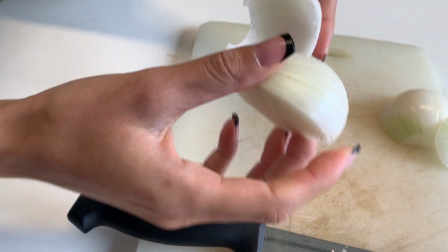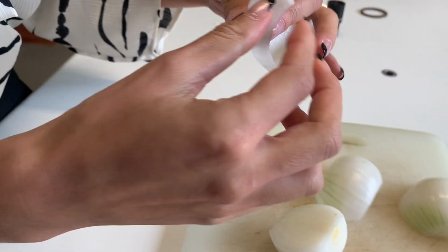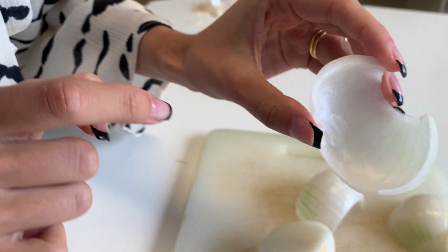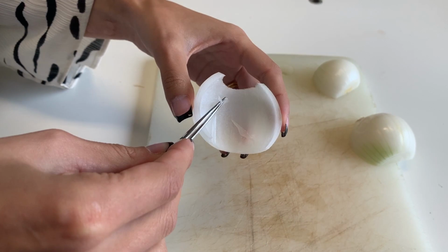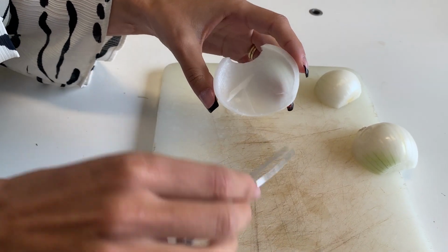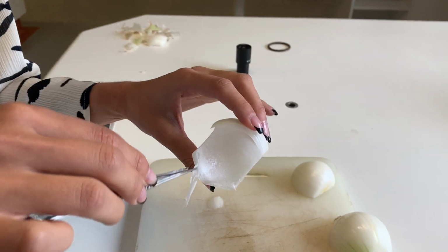So we're just going to peel off a segment here so we can start peeling off that thin membrane for us to view, and we can see there it's already peeling off nice. We've got a nice little thin piece here that we can peel off, and it will start folding in on itself, but that's all right. We'll undo that when we put it on the slide. So you want a nice thin membrane there.